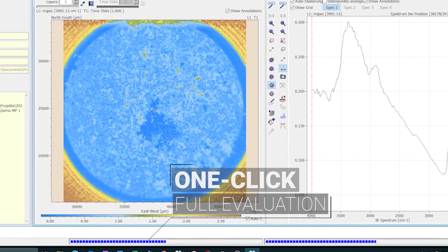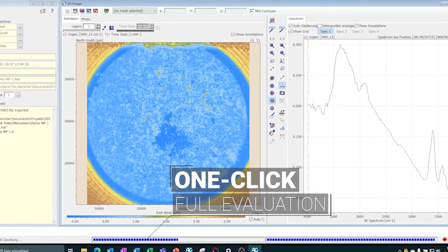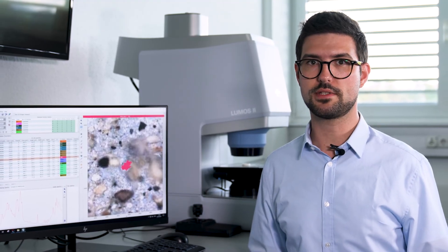With just one click, you get a full evaluation of all the particles on the filter. If you're working in analytical service, your customers will love your reports. The combination of a one-button analysis tool like Purency's microplastics finder and a true imaging solution like the Lumos II is a future-proof method for everybody.